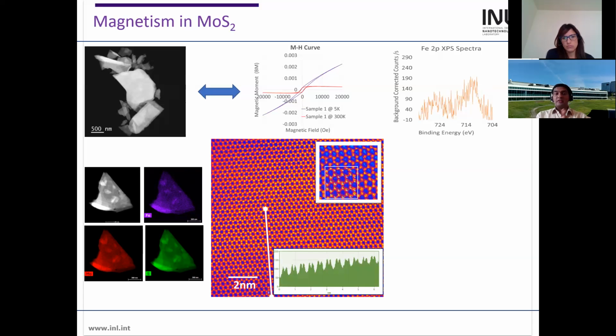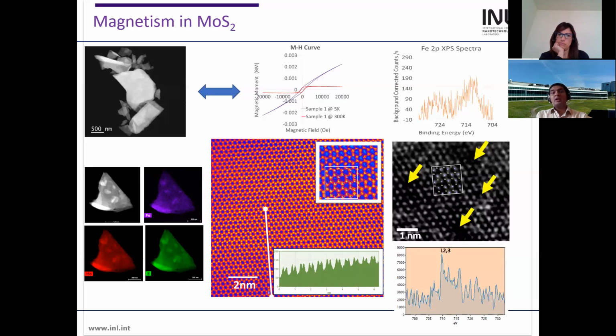This is just the high resolution STEM HAADF map, identifying that it is the molybdenum disulfide sample that we are interested in. It matches with the structure of the known molybdenum disulfide, and we can actually see the position of each atom along with its crystallography.